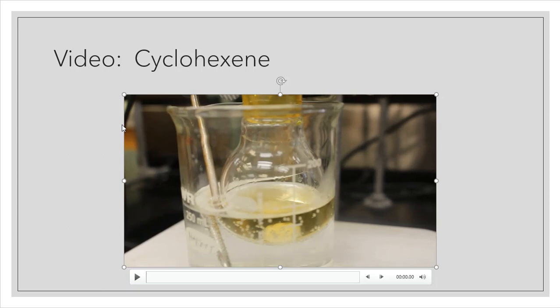All right, guys, that's one of the things that I really hate about lab classes. As a student, I had a couple of instructors who just said, follow the directions and just do it, and you never really question the steps. Why did we add cyclohexene at this point? There had to be a reason for it. Well, no one really took the time to explain that addition. Why was that required? Why did it tell me to do this? I think sometimes we overlook that, or take it for granted, and this is one of those cases where it's very relevant. So that's why I paused and gave you a little bit of theory in this lecture experiment as well.